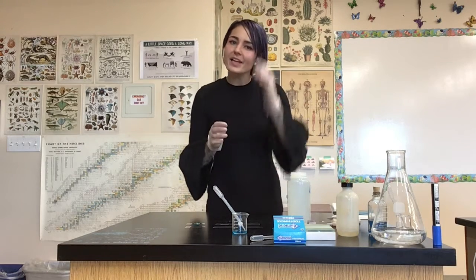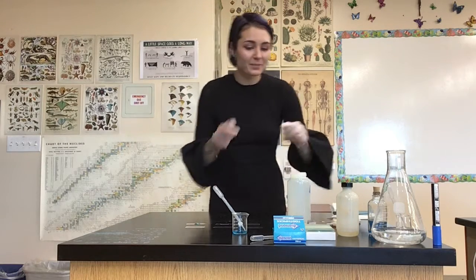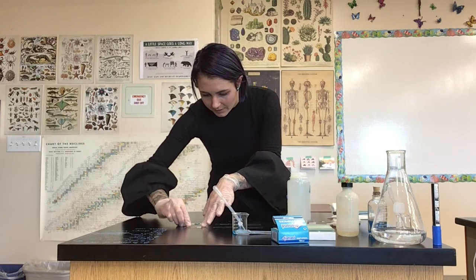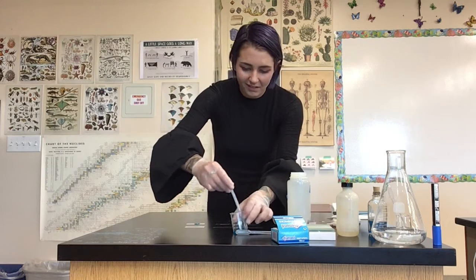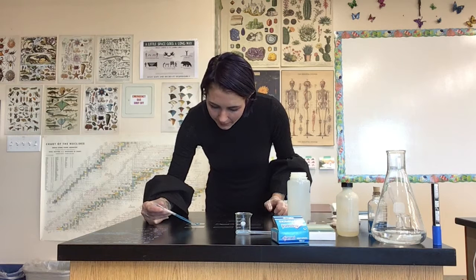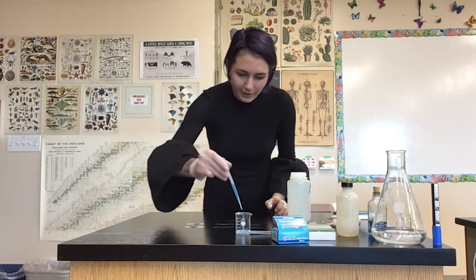Alright, so I was able to see my cheek cells. I'm going to make another slide because I didn't see any cheek cells undergoing mitosis, and like I said, I've got all of my supplies out here. It's not very difficult. Apply it to the slide here. Same exact process. I'm just putting the toothpick down and putting some methylene blue over it to stain what I'm hoping are some cheek cells that are undergoing mitosis. That is the goal. That is what we're looking for here.